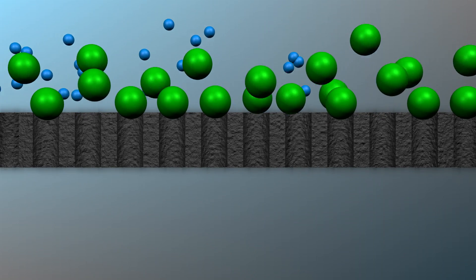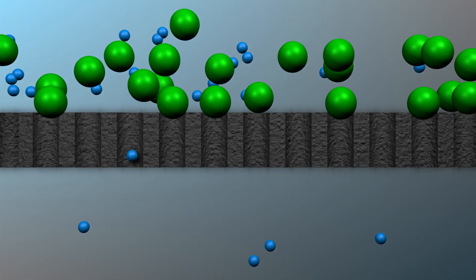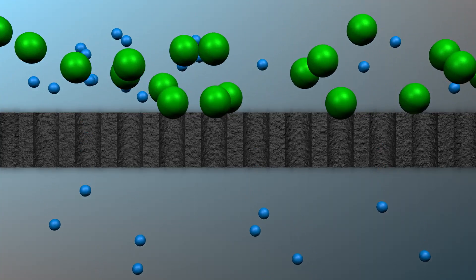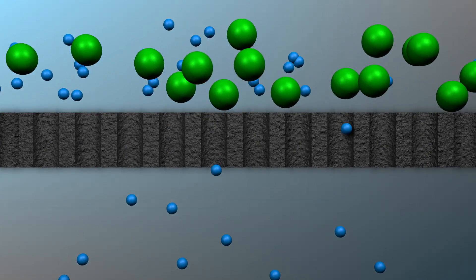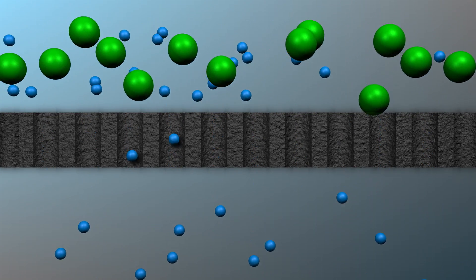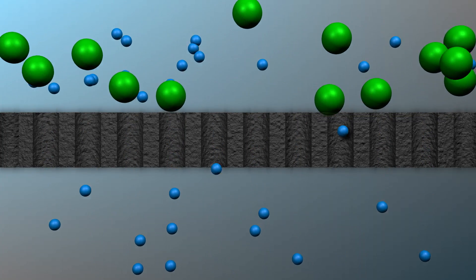As this diafiltration step proceeds, the buffer solution that's being added to the feed replaces the buffer solution that the GFP was originally in, effectively removing any remaining salt as well.